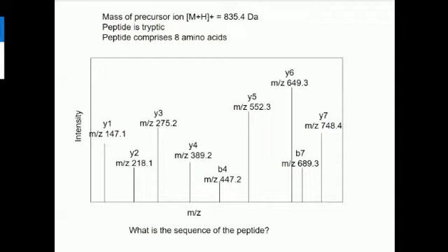And then, who's got phenylalanine here? Okay, it's a common mistake. The Y1 fragment, the structure of it, is the amino acid residue, plus the hydrogen at the N-terminus, and the OH, and the charge. So the mass of that Y1 includes these components.